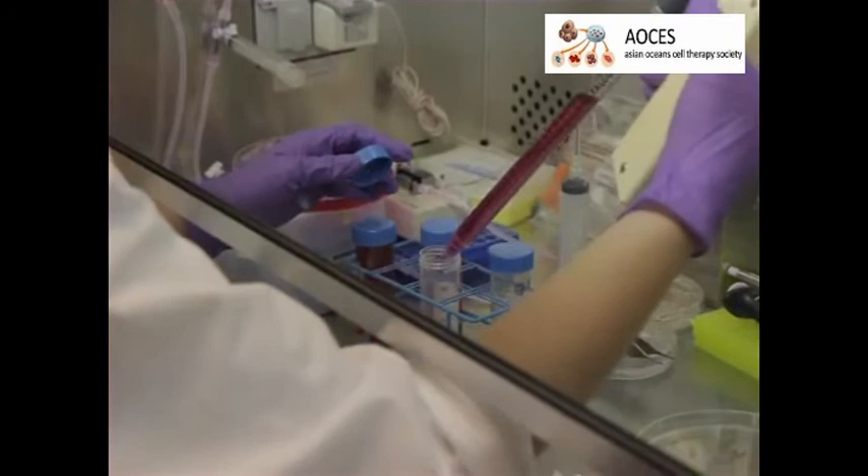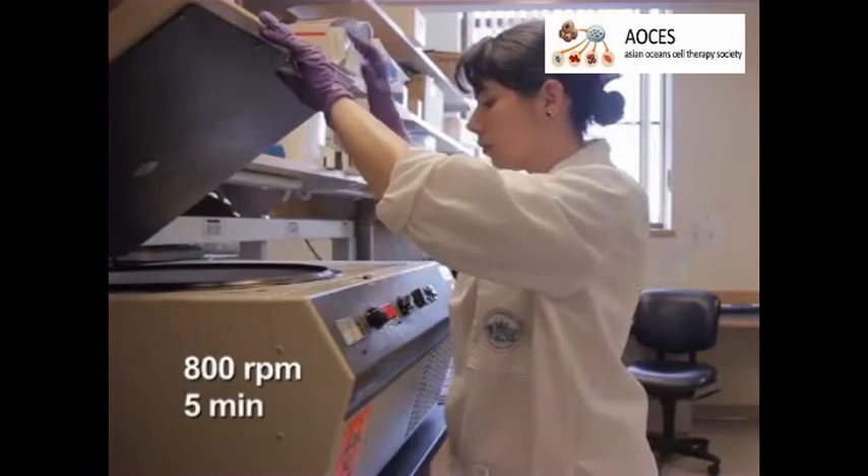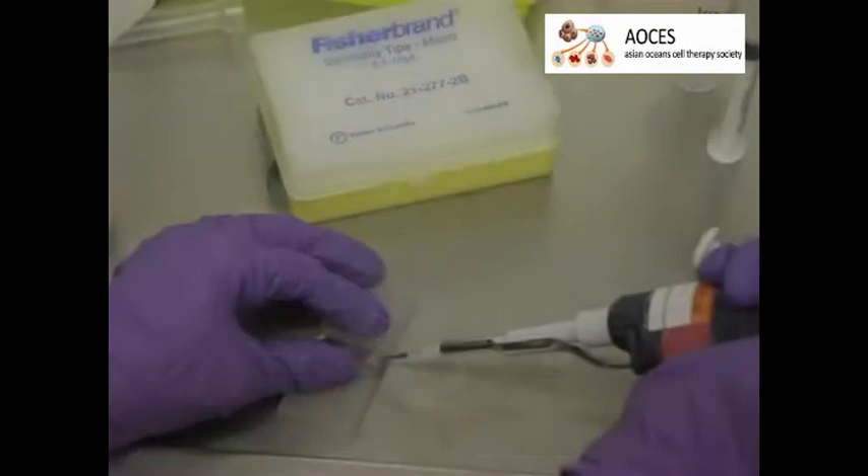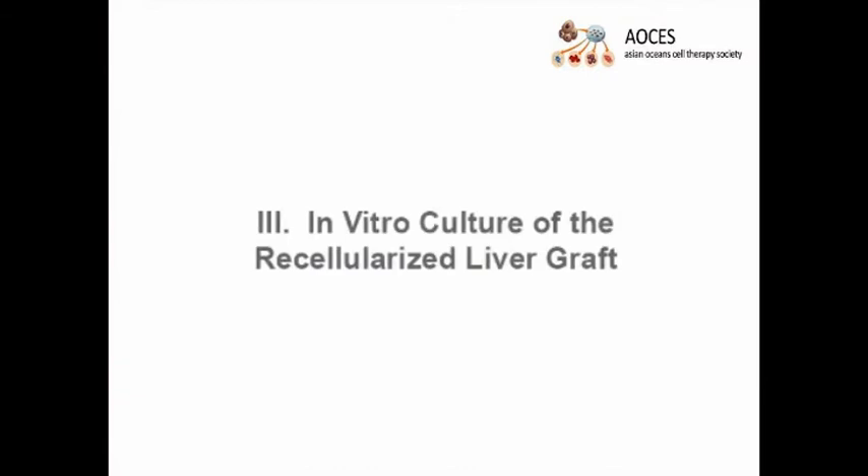Once all the cells have been injected into the DLM, collect the perfusate into 50-milliliter centrifuge tubes and centrifuge at 800 RPM for 5 minutes. Discard the supernatants and combine the pellets into a single tube. Determine the number of cells and their viability via trypan blue exclusion to establish the seeding efficiency.